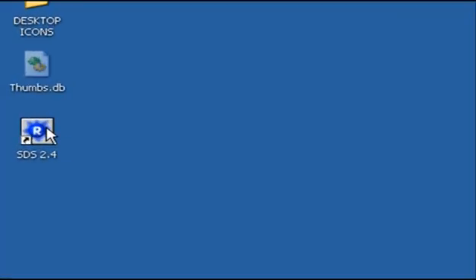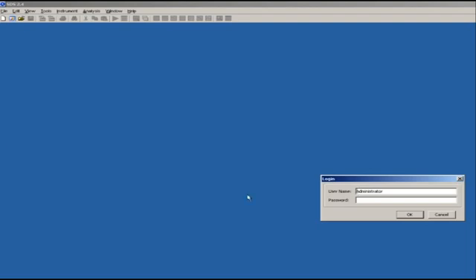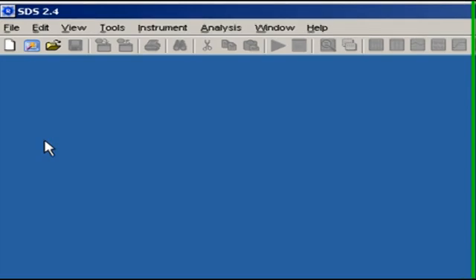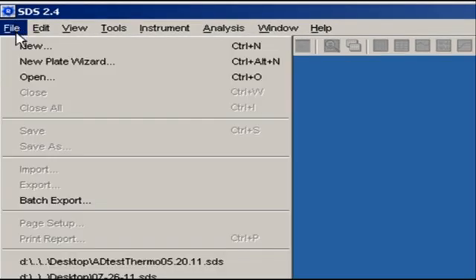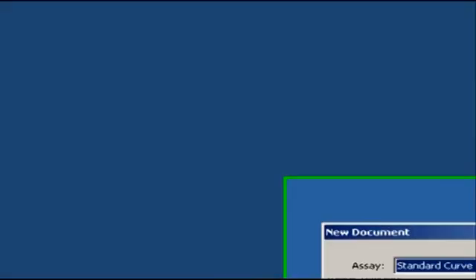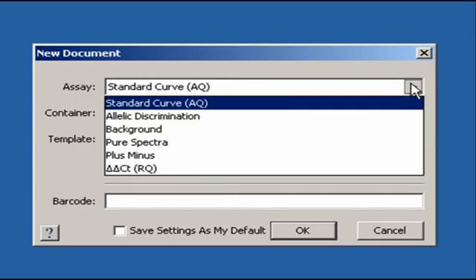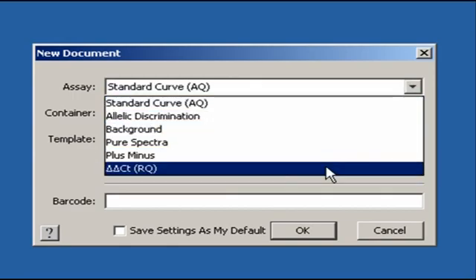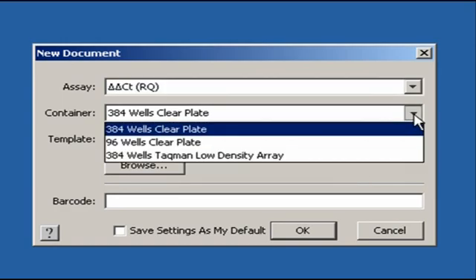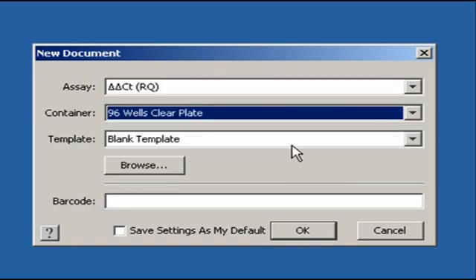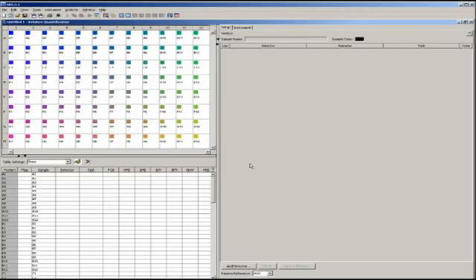Let's look at how to set up a Delta Delta CT run in the 7900. I'm working with software version 2.4, but older versions work similarly. To begin, go to File, New, and choose Delta Delta CT as the experiment type. I also need to select the correct container type. Let's pretend for now that this is a 96-well plate. Now, click OK.